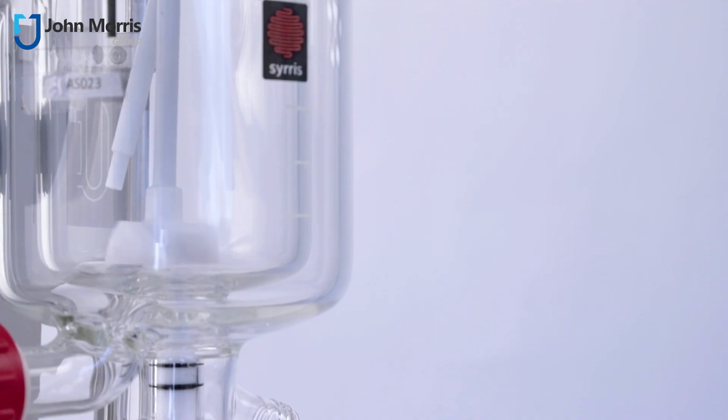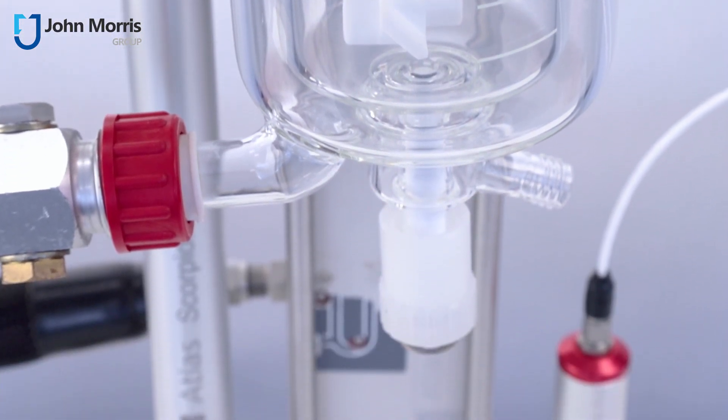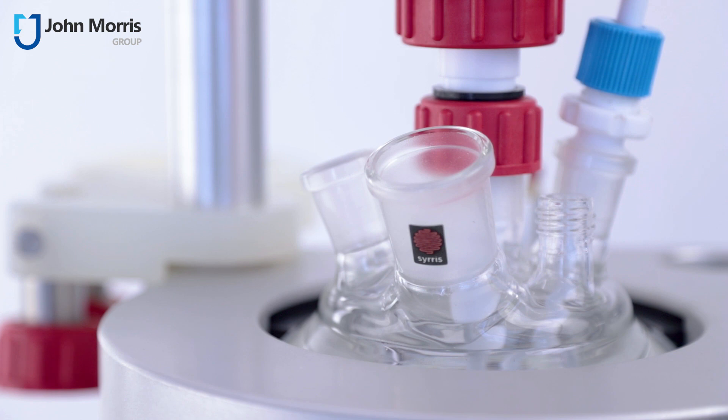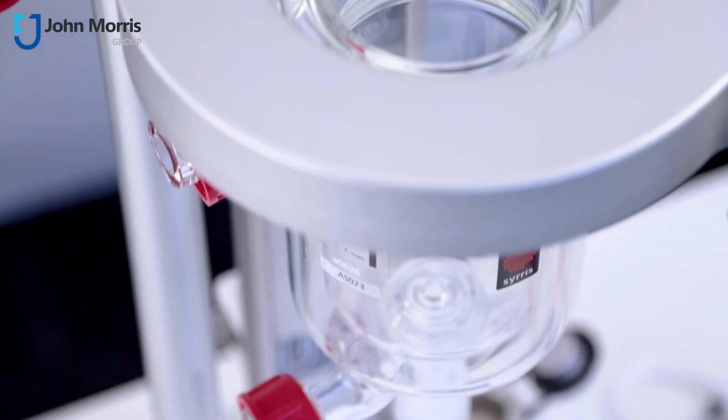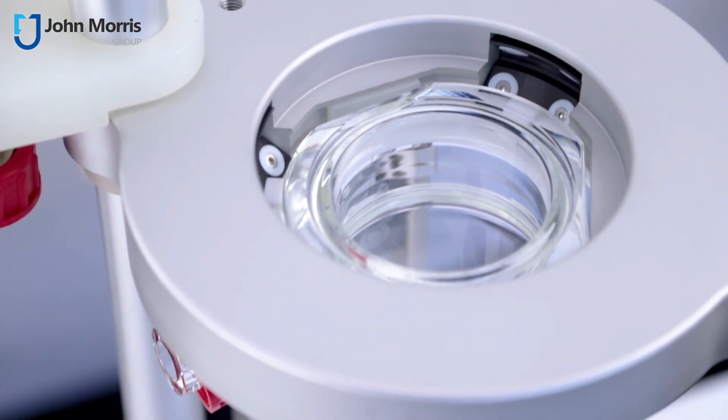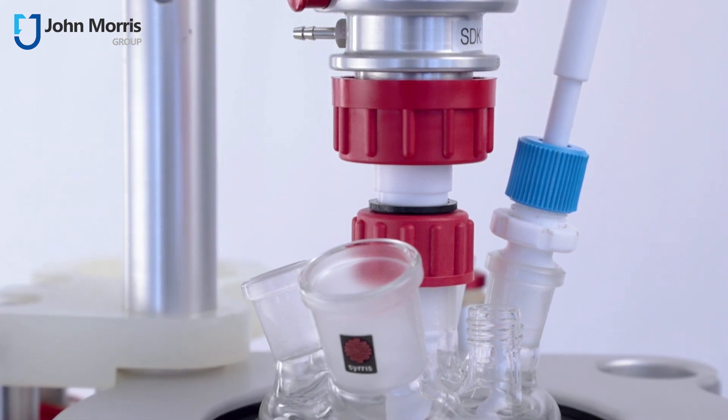It's easy to upgrade to a range of specific applications including pH control, crystallization, high pressure, reaction calorimetry systems, so that you can do polymerization, process chemistry, parallel chemistry, nanoparticle synthesis, crystallization, etc.